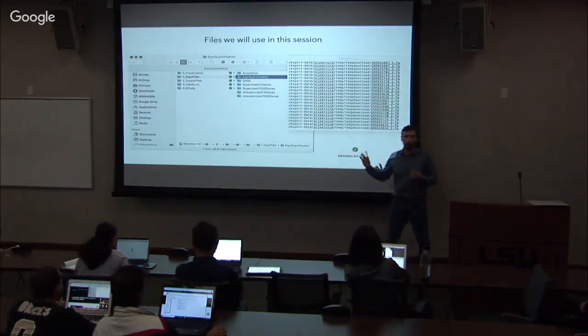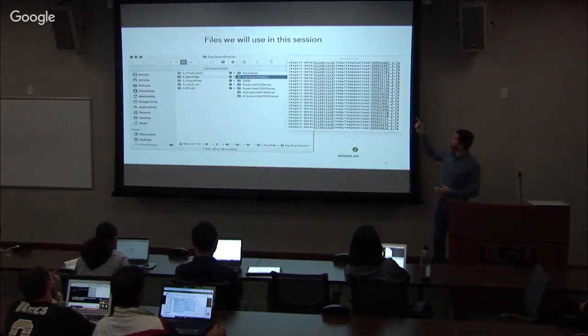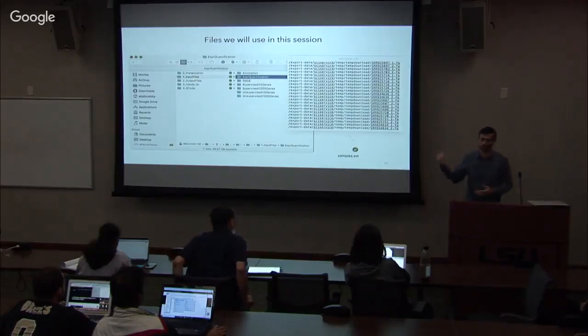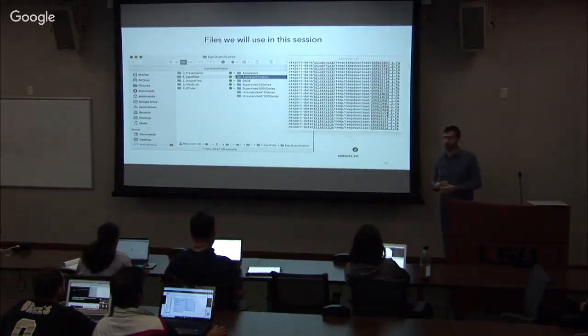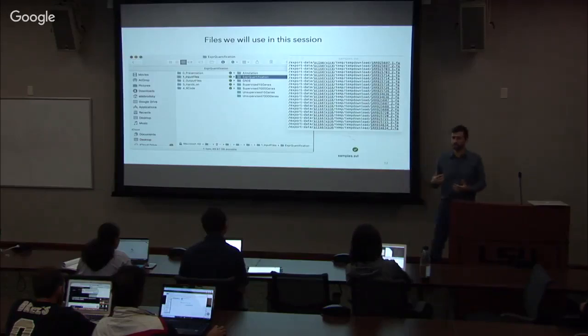Inside this file, all we did was we downloaded the raw FASTQ files and we uploaded them on the server that we're going to be working on. And so you have SRAs, sequence read archive files, that are represented by paired FASTQ files. So you see the _1 and _2. SRA is an archive, kind of like a zip archive. So you have to extract the SRA archive, and then you get what's inside, which is raw FASTQ files.